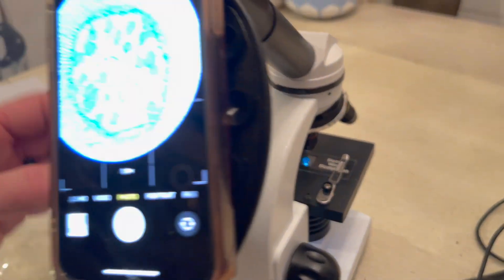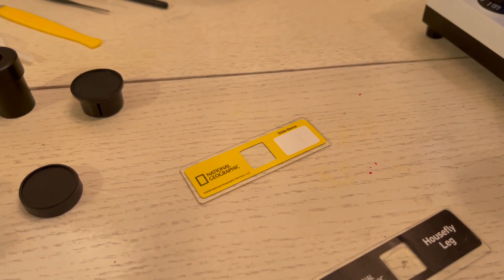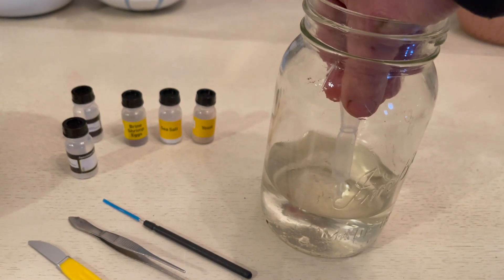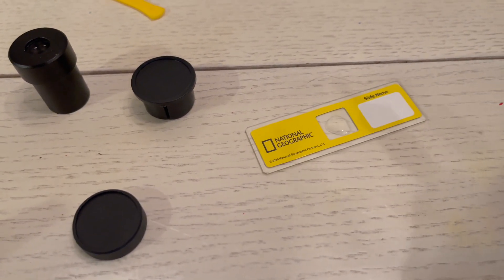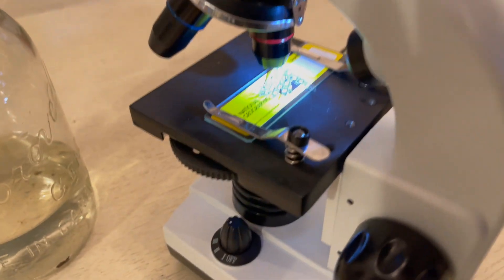There are a lot of different tools included that you can use to create your own slides — a slicing tool, different lenses, blank slides, and a syringe that you can use to pull up water or other liquids and place them on your slides. There is also a scalpel and a needle so that you can get fine samples if you need them.